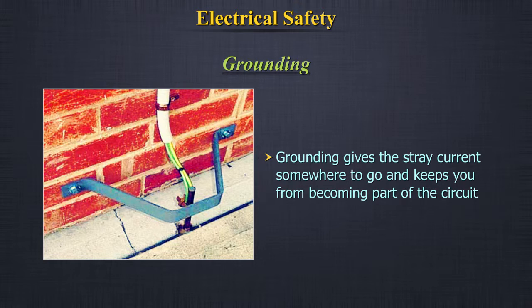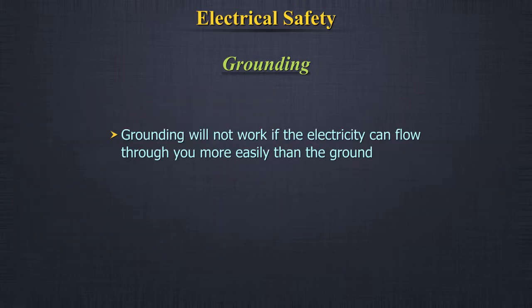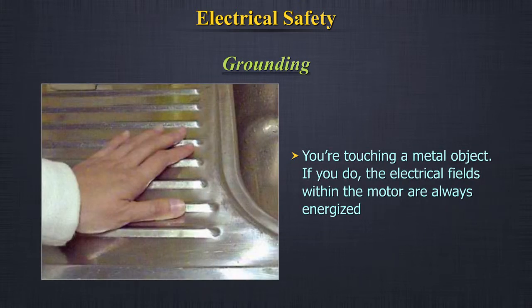Electric equipment operating at 50 volts or more must be guarded. Grounding: grounding gives stray current somewhere to go and keeps you from becoming part of the circuit. All electrical laboratory equipment should be earthed or grounded, preferably through three-pronged plugs. Do not reverse polarity. Grounding will not work if electricity can flow through you more easily than through the ground. This can happen when your tool doesn't have a ground pin, you're working in wet locations, or you're touching a metal object.